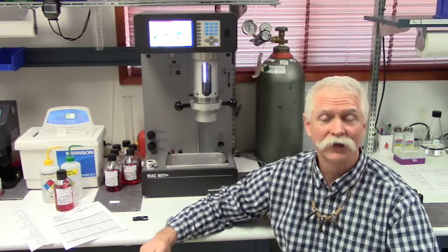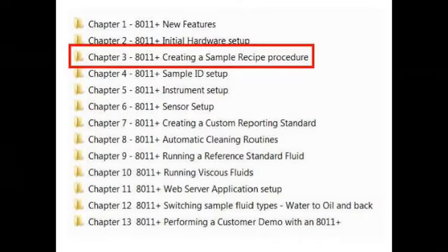Of course, the next thing you're going to do is you're going to help the customer create your sample recipe. And you're going to step them through that process and that's covered in Chapter 3 of the video series.